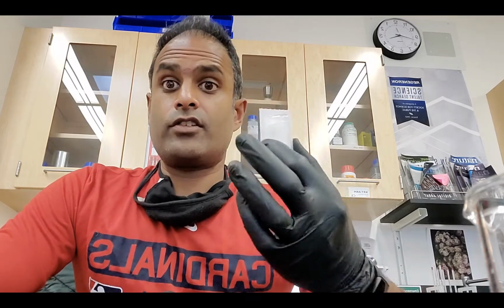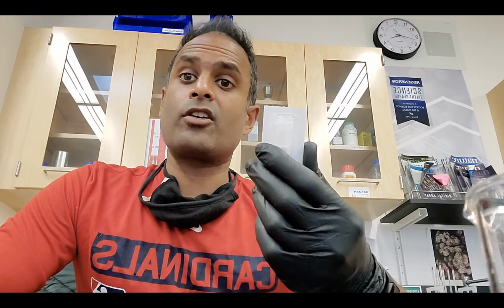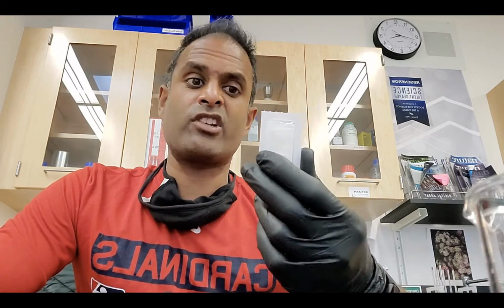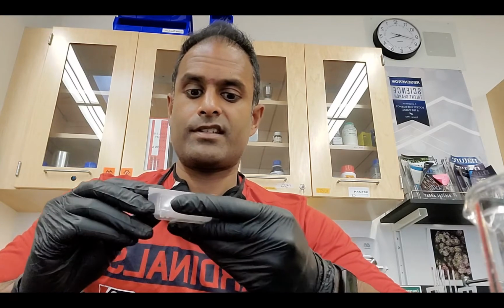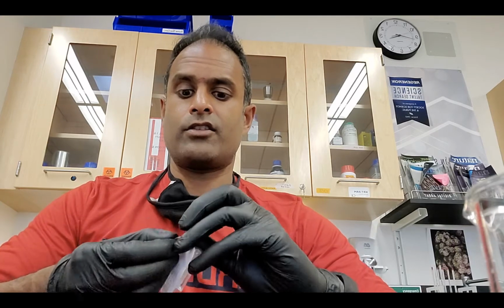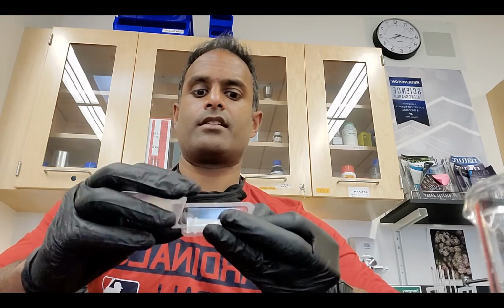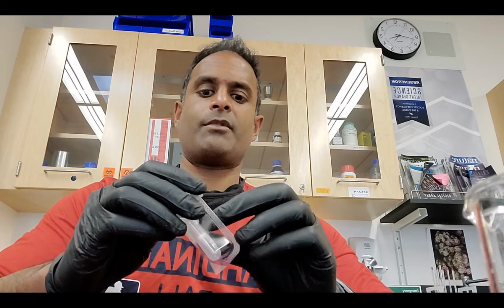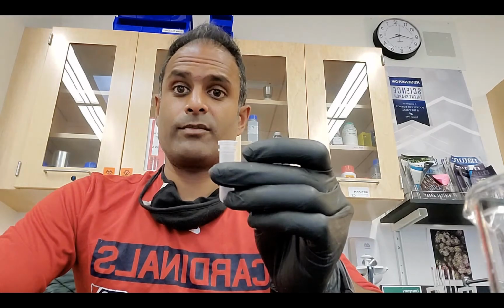Okay, the other thing you're going to need to do is use your DNA isolation tube. This is called the DNA Easy column. We generally call this a column. So I'm going to go ahead and try to open this, and hopefully that will go better than the pipette did. Usually there's a corner that I can use. Great. Okay. I'm going to avoid touching the inside of the tube as much as possible.